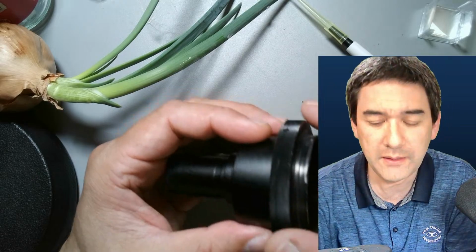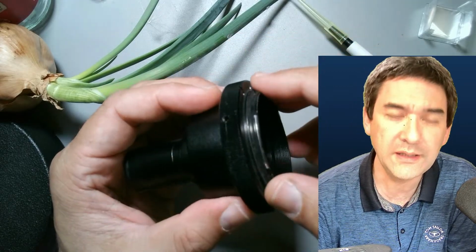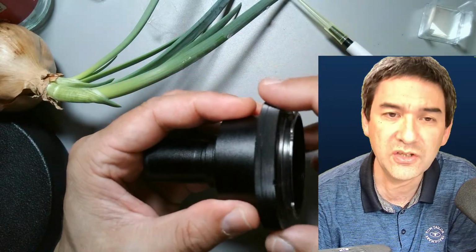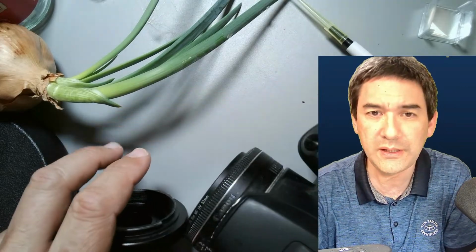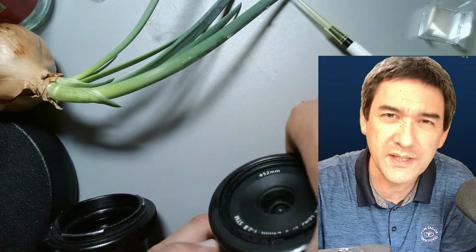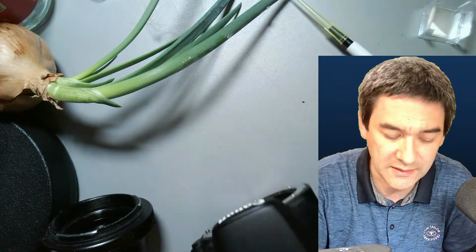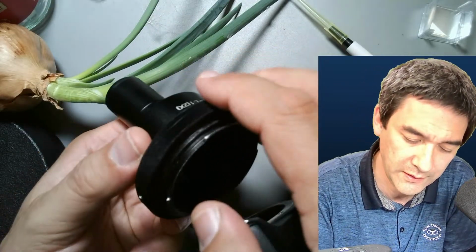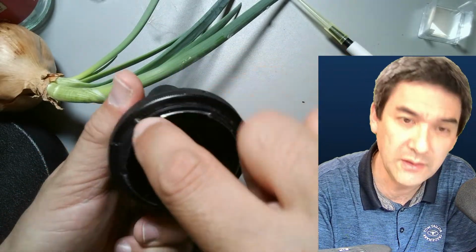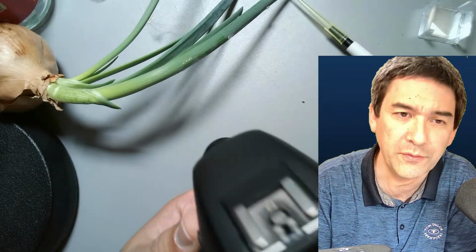What you can do is use those adapters here, and they can be put directly into the photo tube, and then they can be connected. This is a so-called T2 adapter ring. They exist for Olympus and for Nikon. I already made separate videos of this to explain it in detail. This kind of goes in here like this. Where is it? I have to find the dot. I think here it is. Okay, it goes in here like this, and then the whole thing goes on top of the microscope.